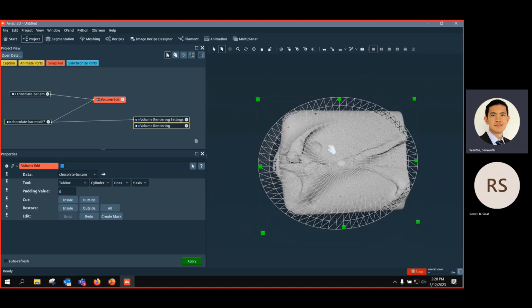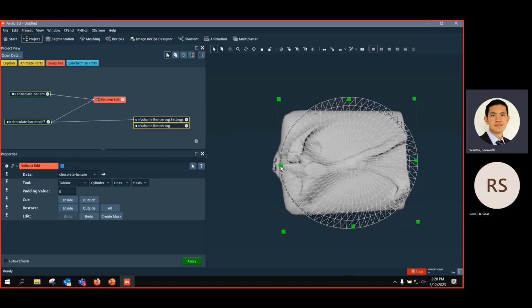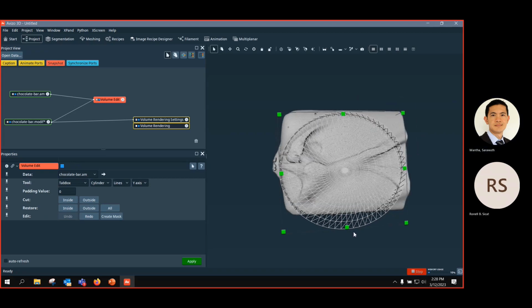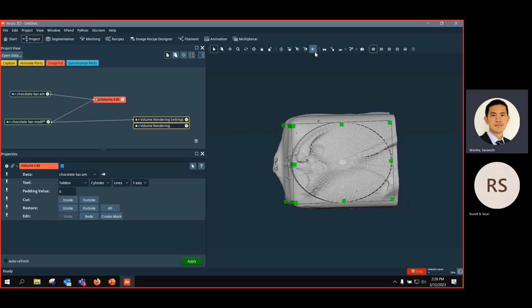So for example, now I want to have the cylinder that has all full border on this side here, by using the way you look at the orthographic view versus the perspective view. For example, I think I touch the border here, and again here, and here, another one here. So in perspective, it looked like it touched, but in reality, if you go back to orthographic, it's already too much because of the way it's projected perspectively.